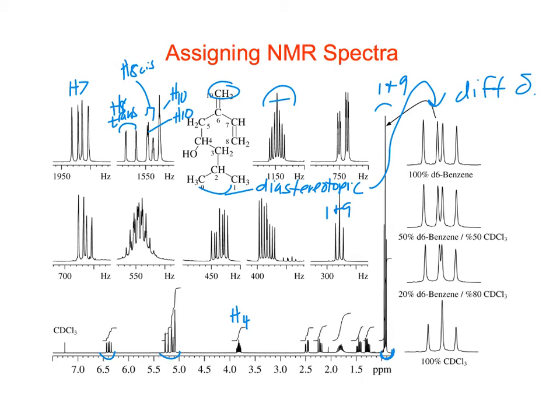So when I look at this spectrum, I see this pair here, and unfortunately they're split between here and over here. But notice how those two are pointing towards each other. If we draw the arrow to the higher side, what that suggests is that these two are a diastereotopic pair of protons. This is one CH2 group.